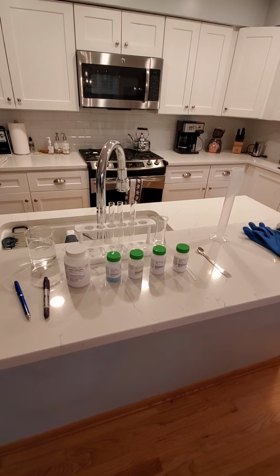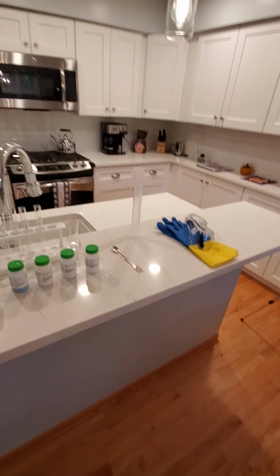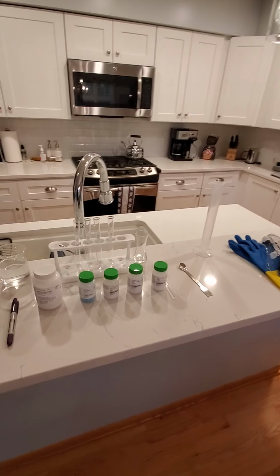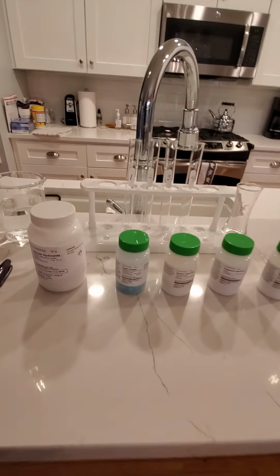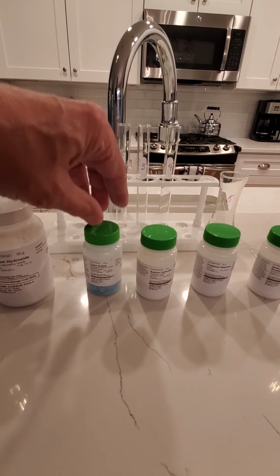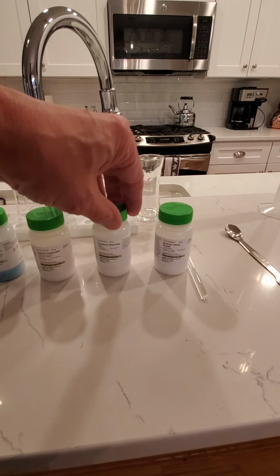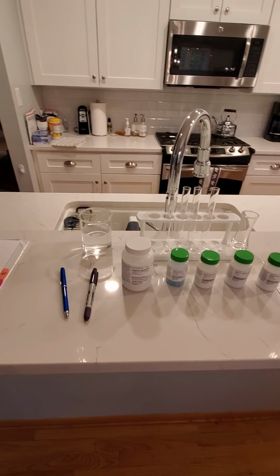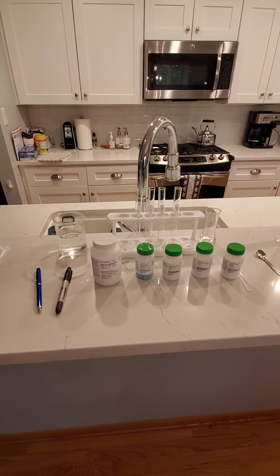So for this qualitative measurement of solubility, this is the equipment that you will need. Of course, you will need your safety glasses and your gloves. And then you will also need your test tubes and 5 of the chemicals that come in your kit that are listed here. So you'll need your calcium hydroxide, cupric sulfate, sodium carbonate, potassium bitartrate, and also some sodium borate, along with some tap water and your test tube rack with test tubes.